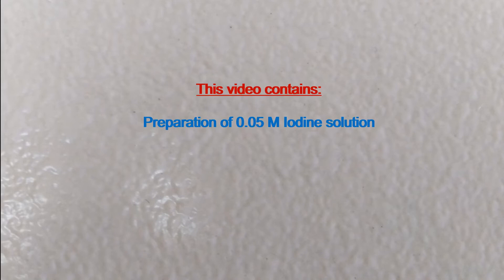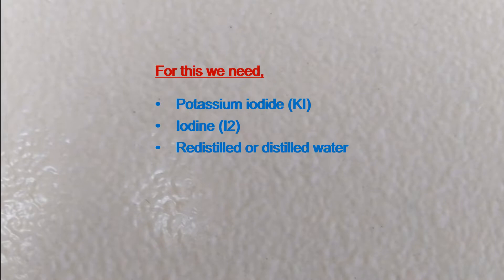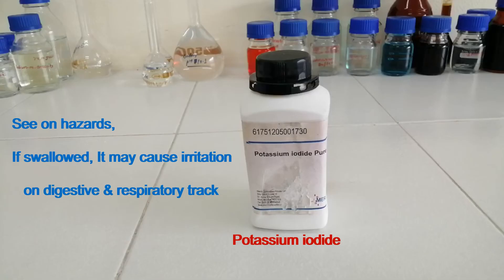This video contains preparation of 0.05 M iodine solution. For this, we need potassium iodide, iodine, and redistilled or distilled water.